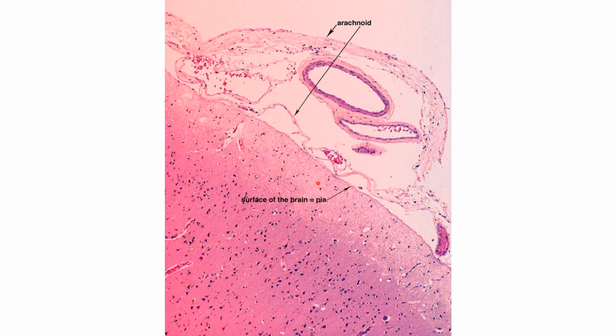And you can see this is lighter stained as compared to the deeper part. So this layer primarily has the fibers coming from the deeper layers, and either the axons or the dendritic processes which form a plexiform network between these fiber synapses, and the nuclei which you are seeing are of the neuroglial cells.